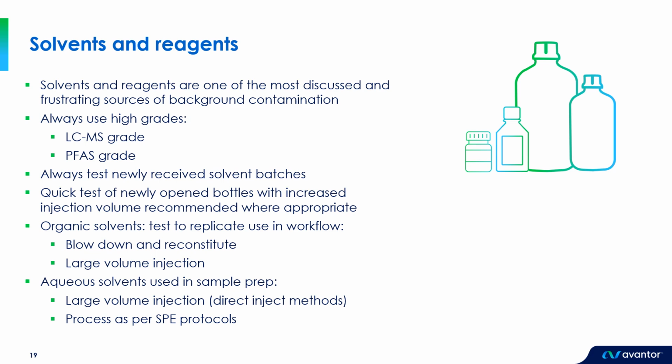When testing organic solvents, it's important to replicate their use in the workflow. So this can be done by either blowing down a volume of solvent and reconstituting it to replicate the workflow, or using a large volume injection, as we discussed a moment ago.